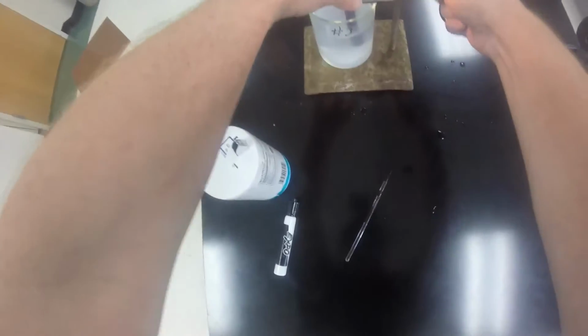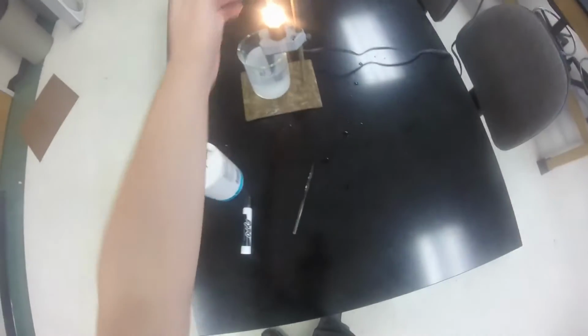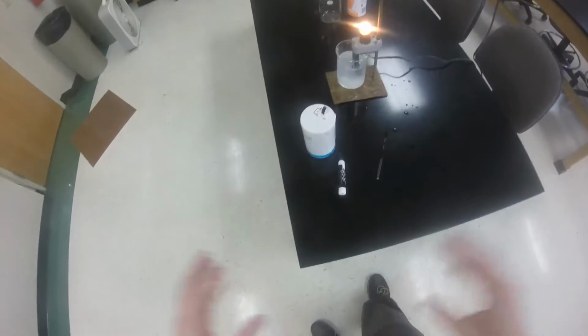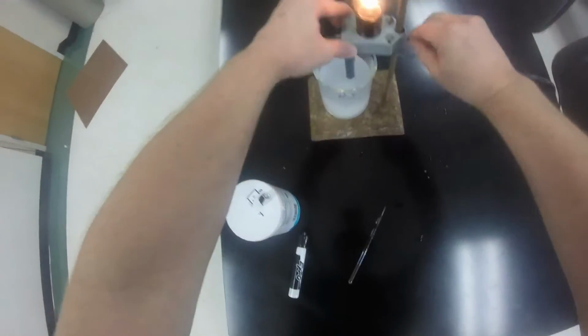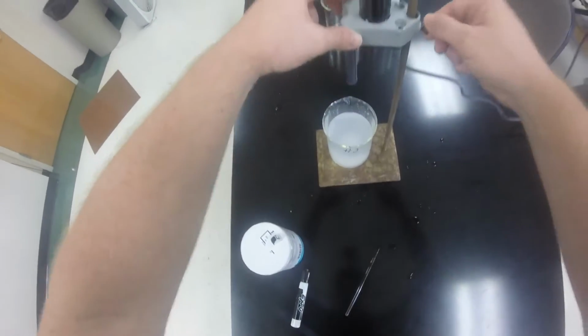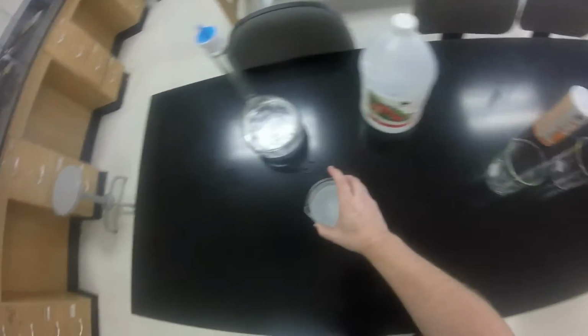Oh, and look at that, the light bulb comes on. It's a nice bright light, which means we not only have charge carriers, but we have a lot of charge carriers because the bulb is so bright. So we're carrying a lot of that current through these two electrodes. Okay, so that's a strong electrolyte. All right, let's look at some of the other ones that we have. Okay, so those are strong electrolytes.